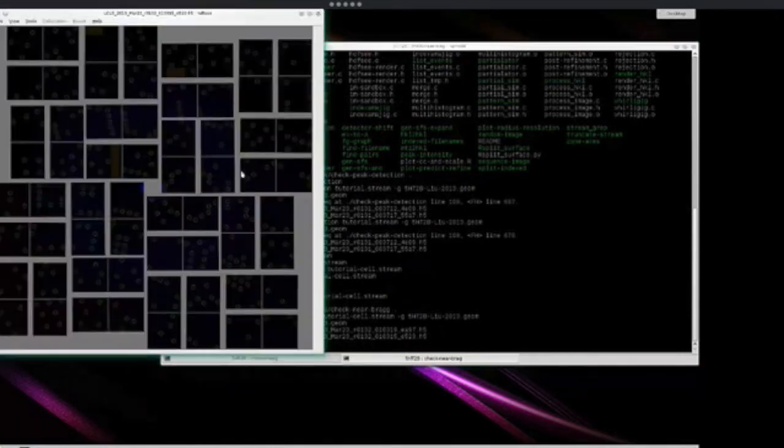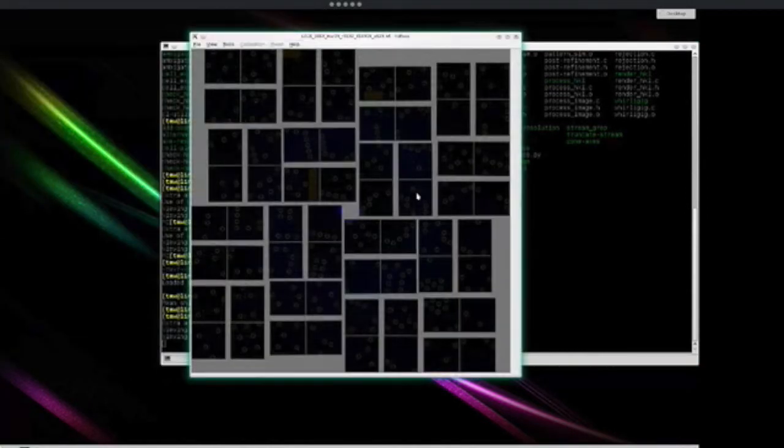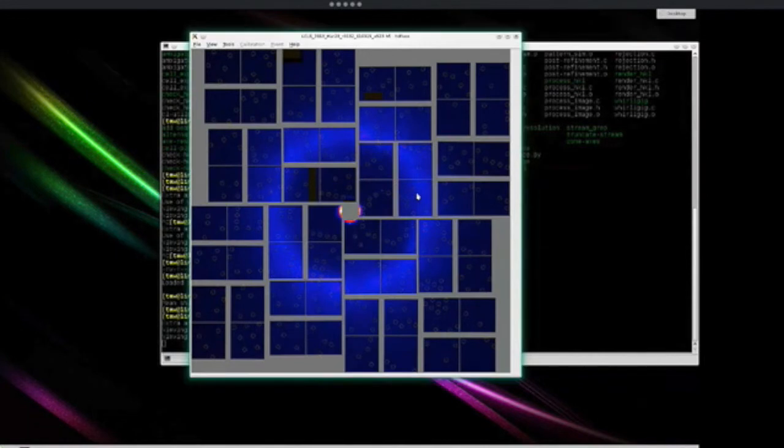Again, you should look at the first maybe 10, or as many as you like, really, as many as you can be bothered to look at to judge the accuracy. So here, if you're particularly eagle-eyed, the prediction itself looks pretty good. It depends how familiar you are with judging the success of indexing, but you should be looking for, if I turn the peaks off, which I can do here, a regularly spaced line of peaks here, and also one up here, the sort of vertical line. If I turn the peaks back on, you can see the predictions follow those lines, so that's a good sign.